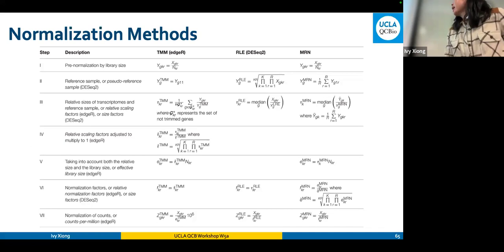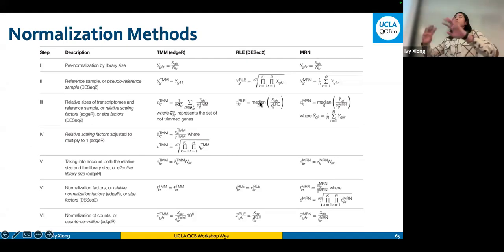So usually people are happy with the DESeq2 kind of normalization. Basically, you take the median of all the genes that we have. You can filter beforehand, for example, if some genes have 0 count, we throw them out. Then you take the median of the remaining genes, and we normalize according to the median.